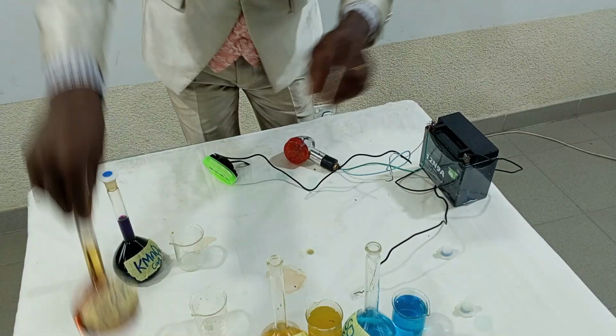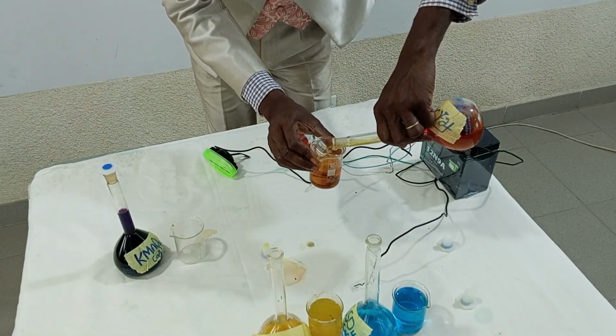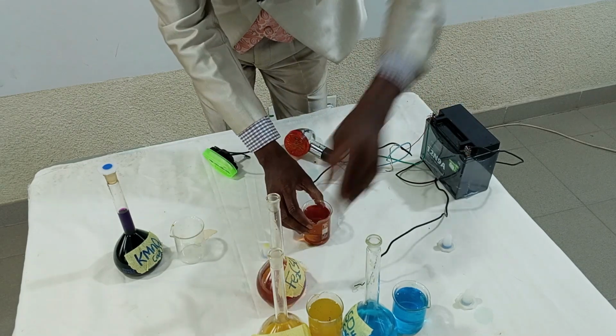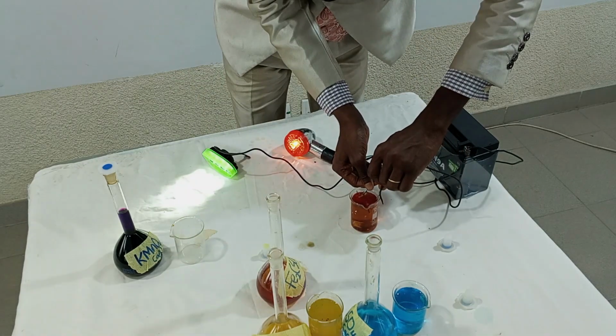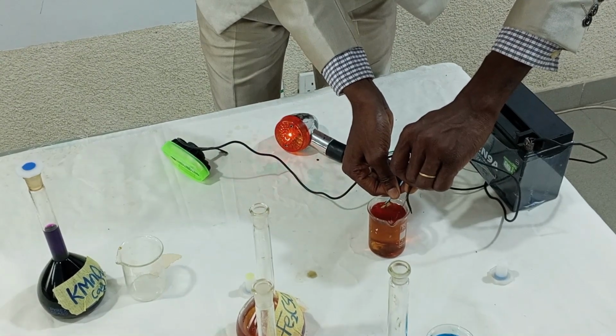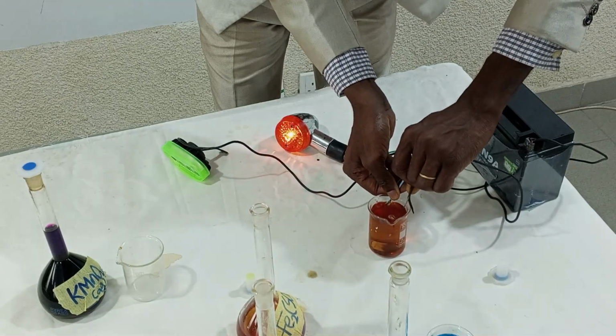We also have iron 3 sulfate here. This salt contains Fe3+ and SO4 2- anions. Let's see. You see, since it also contains Fe3+ ions and SO4 2- ions, they are ions, so they can also conduct electricity.